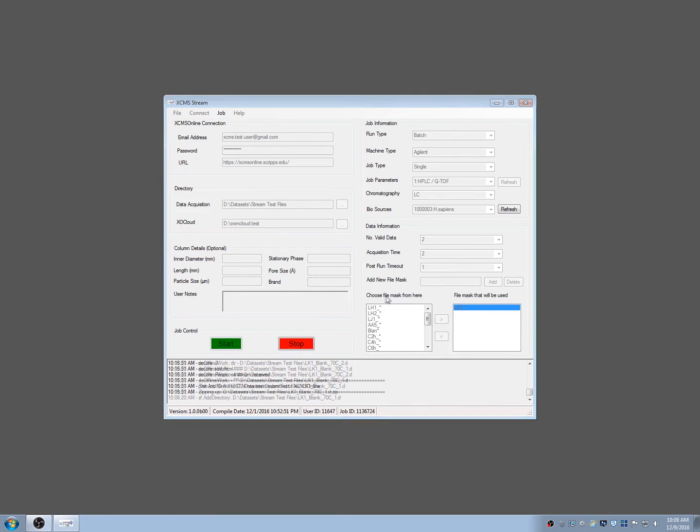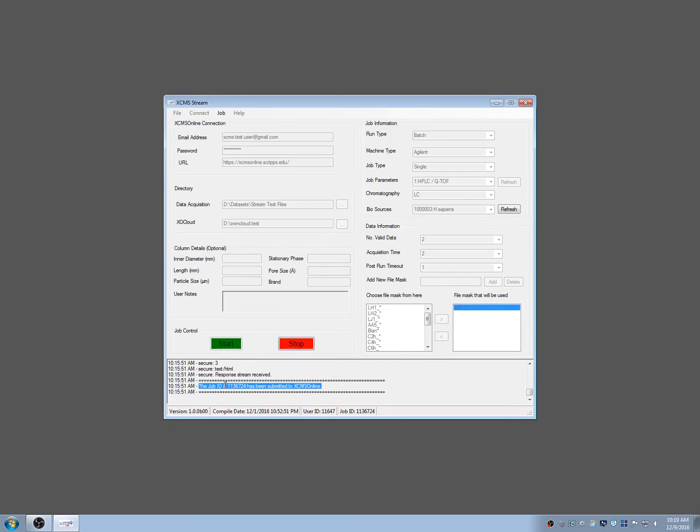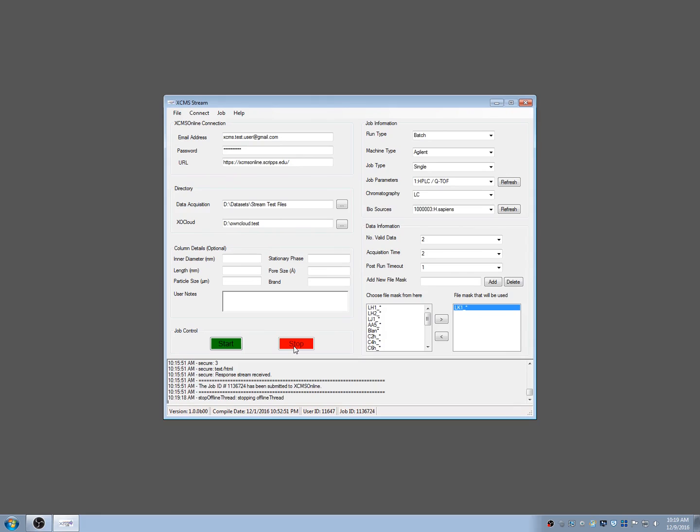The log at the bottom of the window displays the progress and will tell you when the job is submitted successfully. You can now stop the streaming utility.